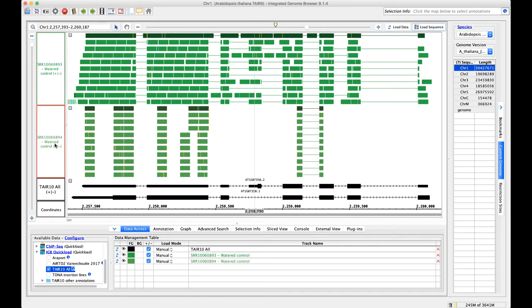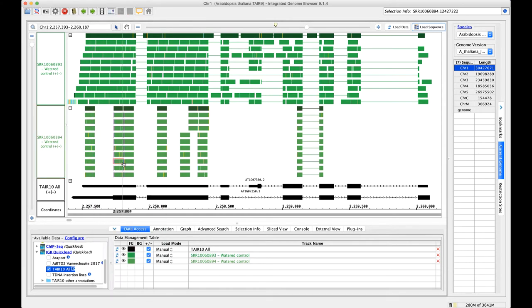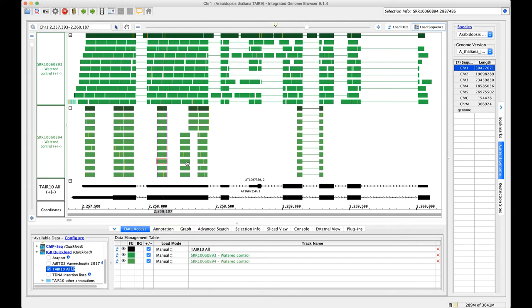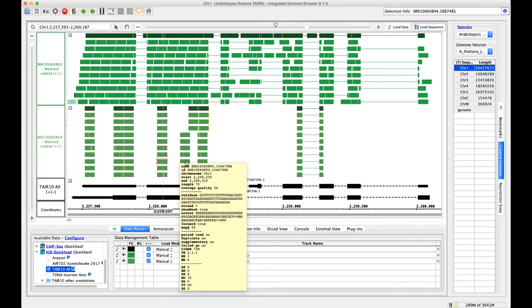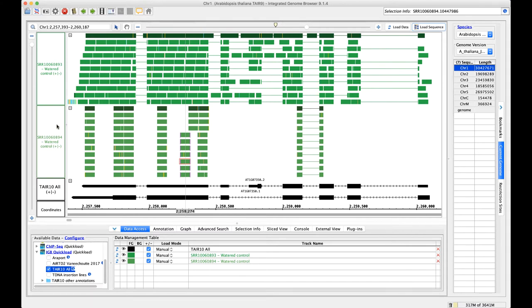894, which is that smaller file. Something is wrong with this file. You can see that the coverage for it is much, much sparser. And it looks like this coverage is very vertical. We've got these stacks of what look like duplicate reads. It turns out that this file had a lot of PCR duplicates. By poking around our data and visualizing it, if we just looked at the number of reads on a spreadsheet, we might not have so clearly and quickly been able to identify that there's something very clearly wrong with this file.